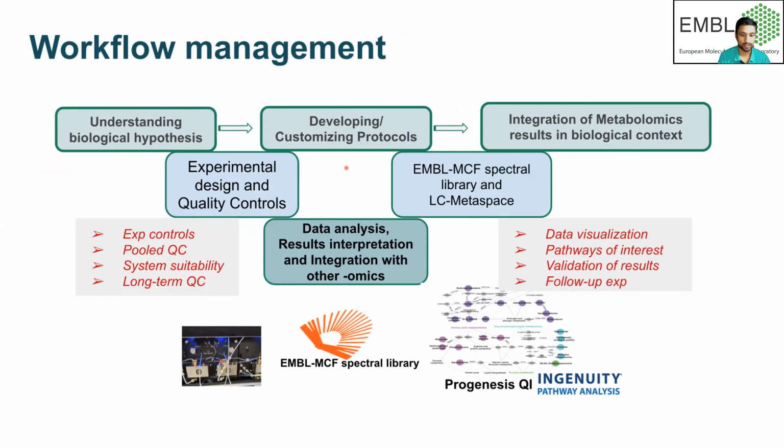So basically, it comes down to the overall workflow. If I reiterate the whole concept, to start with, first decide what kind of platform we want to use, whether we have a hypothesis or whether we want to generate a hypothesis. So you have to first understand your hypothesis, then develop or decide the protocol according to it, and then most important is making sense of the data by integrating it in your biological context. And at each stage as I develop, you need a solid experimental design and quality control to generate reliable data.